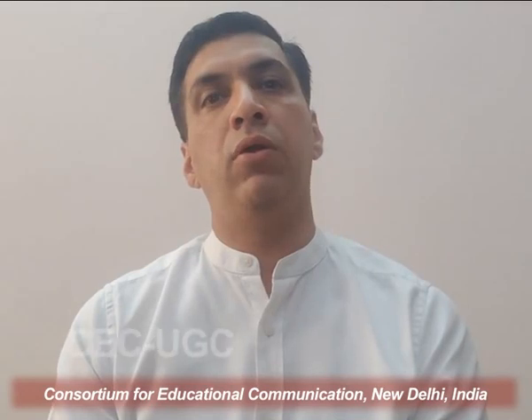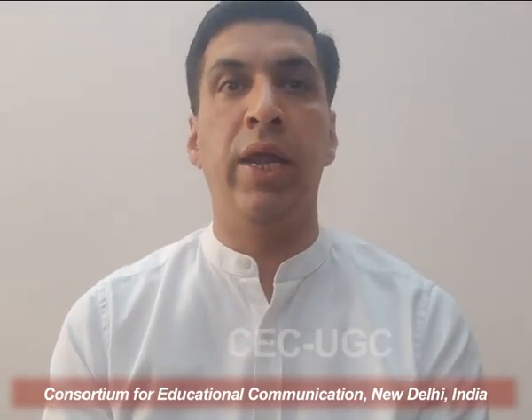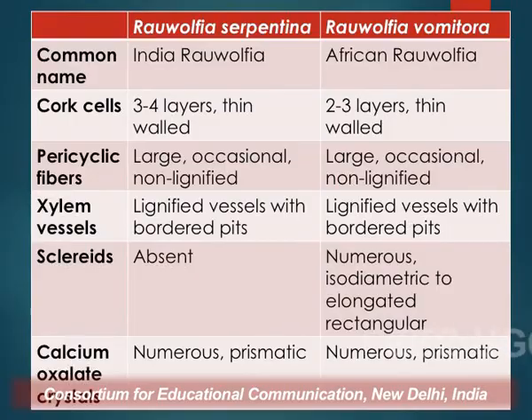So presence of sclereids will clearly show that the powder sample of Rauwolfia that you have obtained is not pure. And again, the calcium oxalate crystals in both the cases are the same, that is, numerous and prismatic.